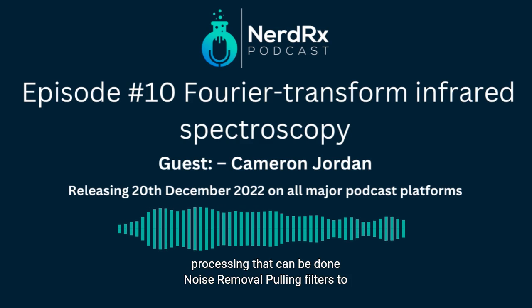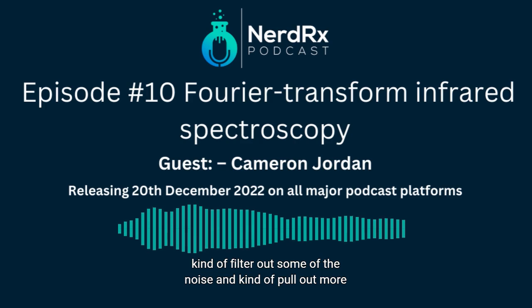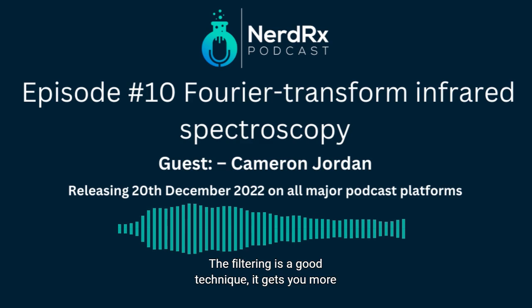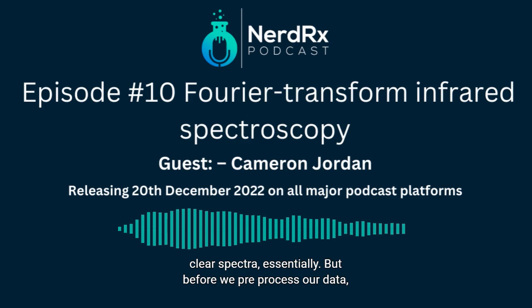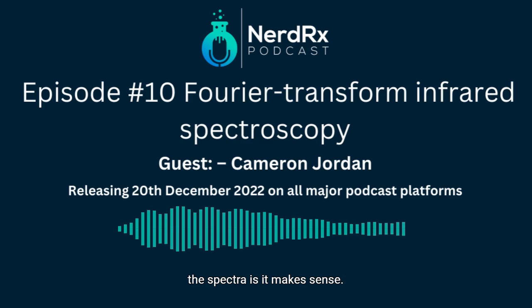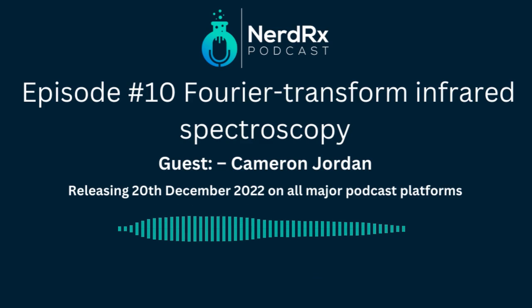There's some preprocessing that can be done, noise removal and filters, to filter out some of the noise and pull out more of the specific regions of the spectra that you're looking at. The filtering is a good technique. It gets you more clear spectra, essentially. But before we pre-process our data and before we build our model, we just like to make sure that the spectra makes sense.